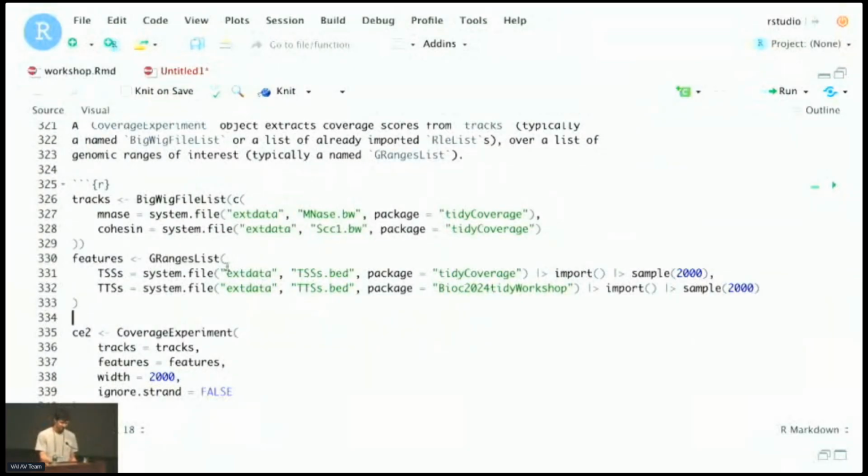I guess I will just query quickly on visualization in the context of a genomic browser. Have you looked at JBrowseR? Is that functional with these sorts of things? Right. So I think these are separate projects.